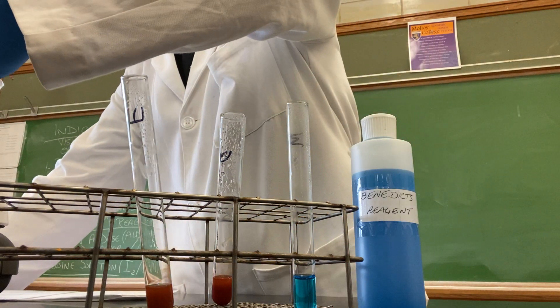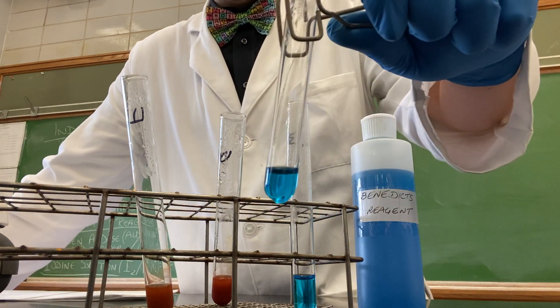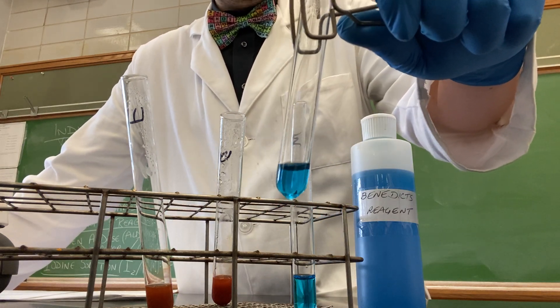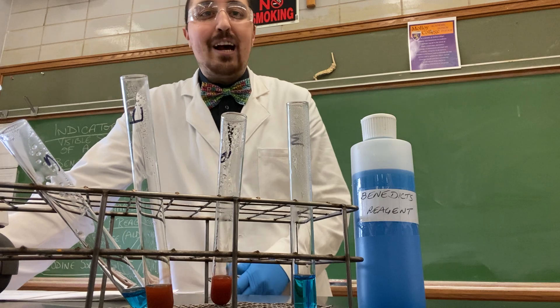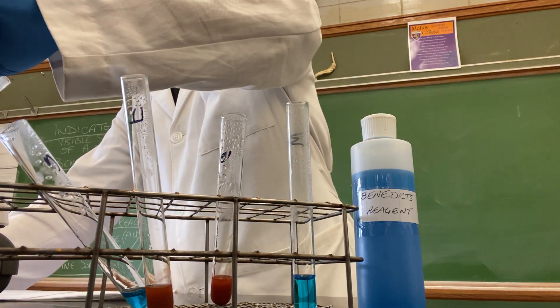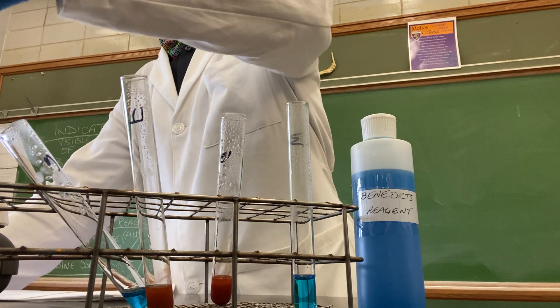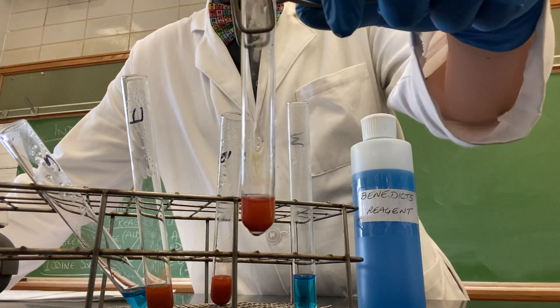Sucrose's solution has remained a blue color, indicating a negative test for reducing sugars. Then we look at another disaccharide, lactose. Lactose has tested positive — it's turned a brick red color, indicating a positive test for reducing sugars.